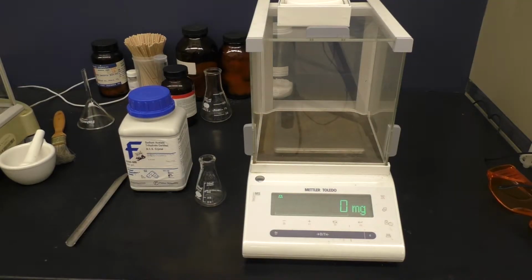While we are waiting for the solution to decolorize, we can now go ahead and prepare our sodium acetate solution. So we'll begin by weighing out 2.5 grams of the sodium acetate.